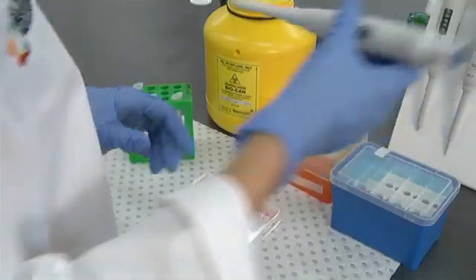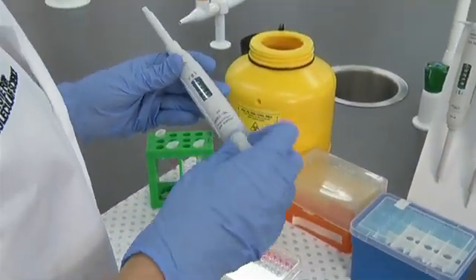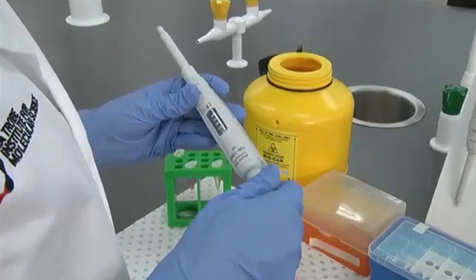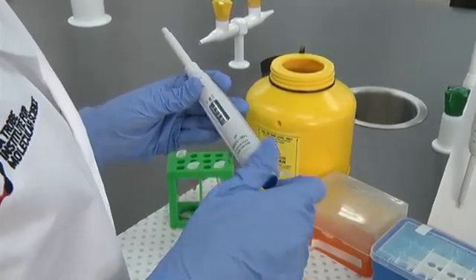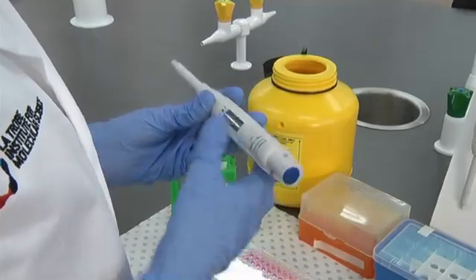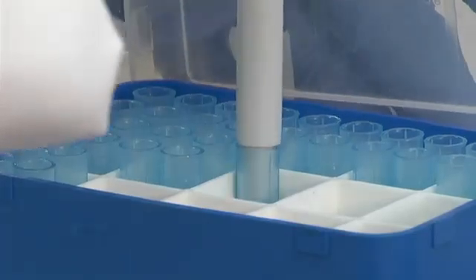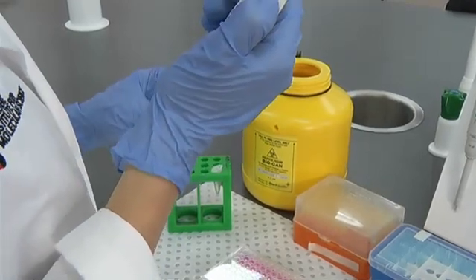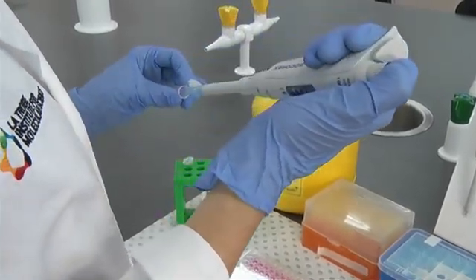Take your pipette and set the volume to about 50% more than you estimated. Add a tip to your pipette, ensuring a tight seal. Depress the plunger down to the first stop, carefully draw the liquid into the tube, and remove the pipette.